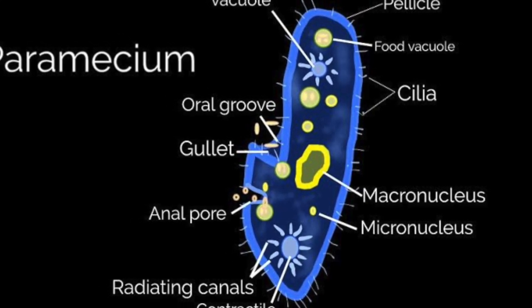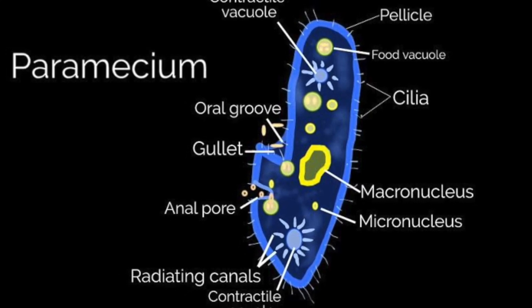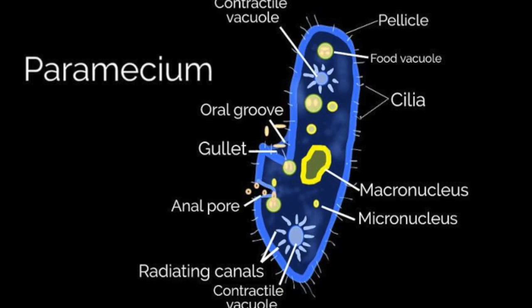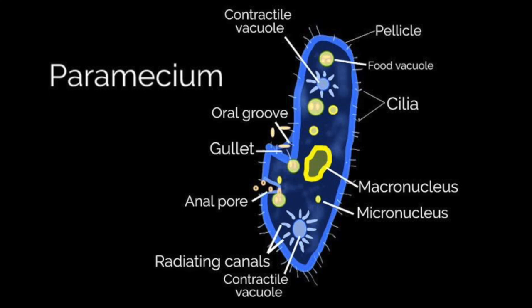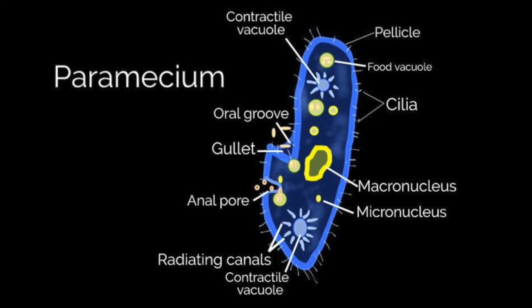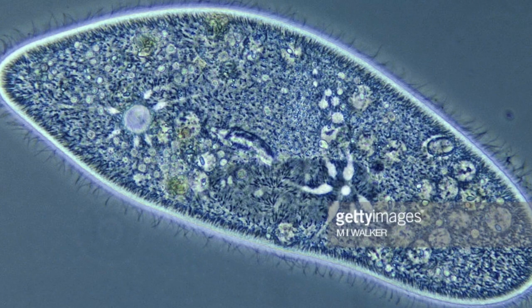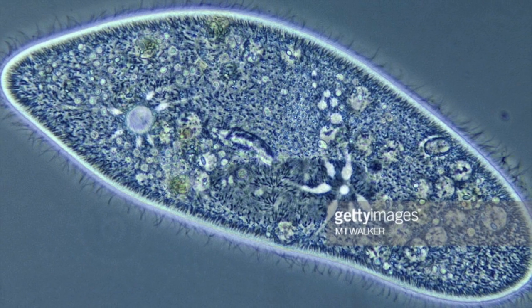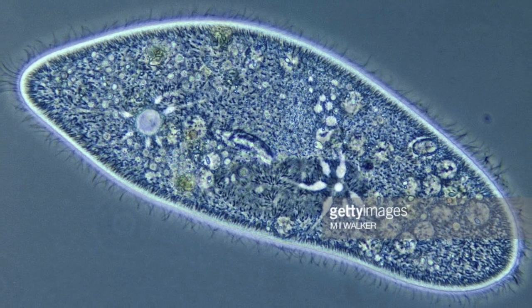The cilia is able to propel the paramecium forward by moving in a whipping motion. When the paramecium hits an object, the cilia propels it backwards and then forwards again. The paramecium's mobility is a major part of its life; it has been calculated that the paramecium spends more than half of its energy on movement through water. Asexual reproduction occurs in the paramecium through binary fission, which leads to the cell dividing transversally, and it often takes place about two to three times per day.